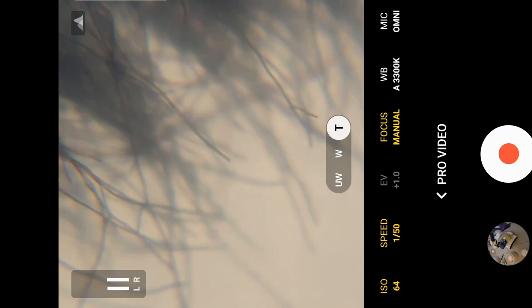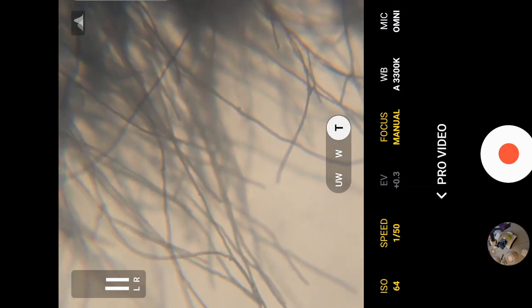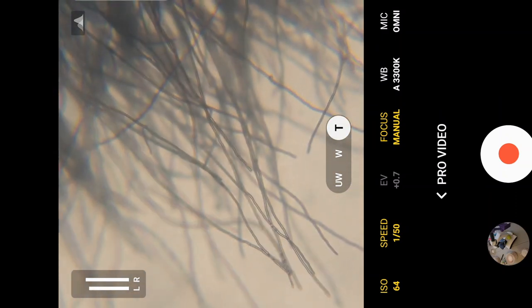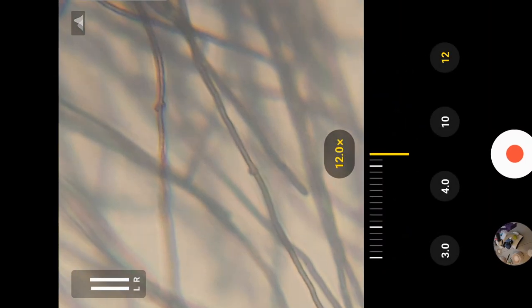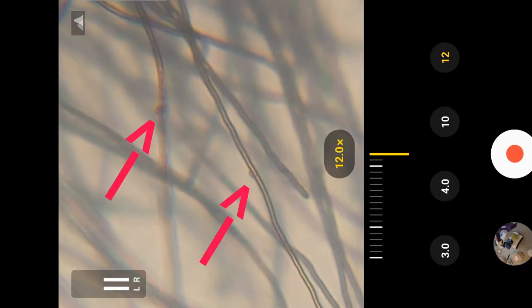I'm just going to find one more example of a clamp connection. It shouldn't take too long on dikaryons, they're all over the place. But on your monocaryons, you should spend a good time sampling to see them. So yep, there's two more right there.